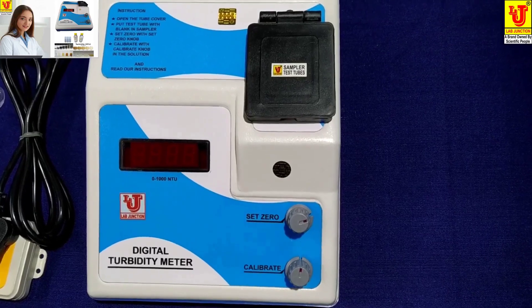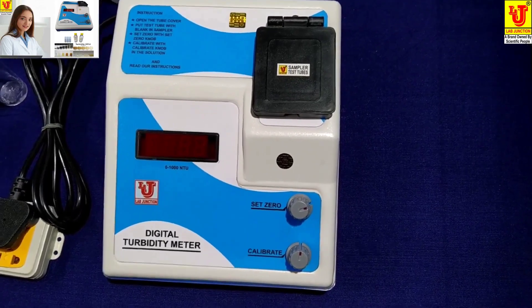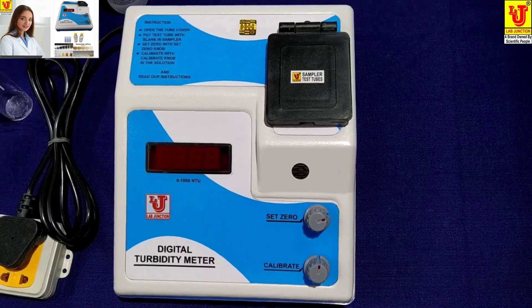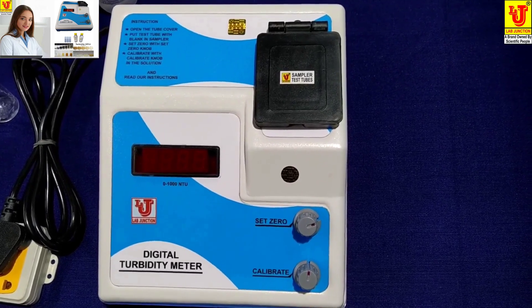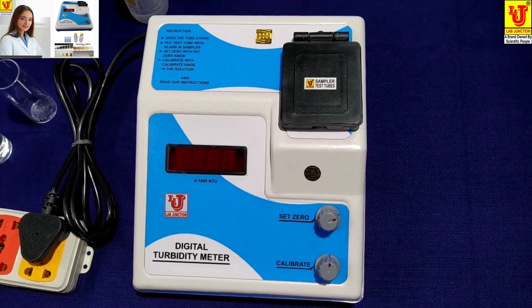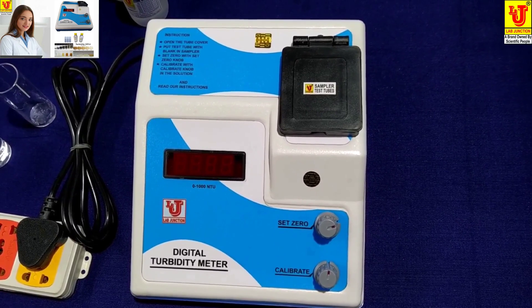Lab Junction's Digital Turbidity Meter, Model LJ331. Always give 10 minutes warm-up before starting the operation of the Digital Turbidity Meter.